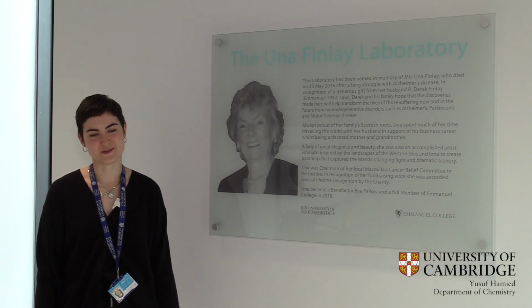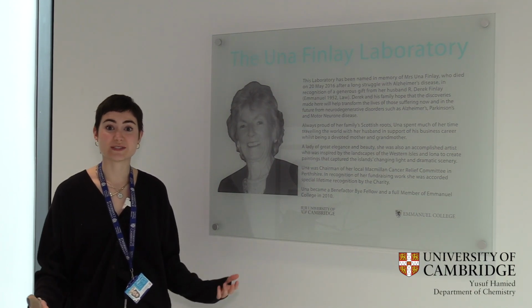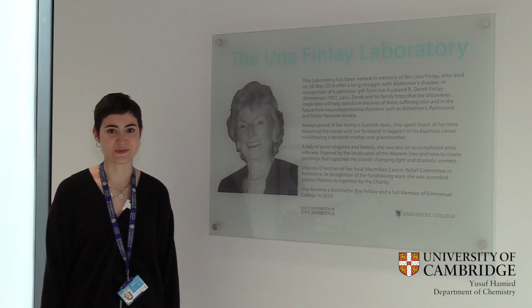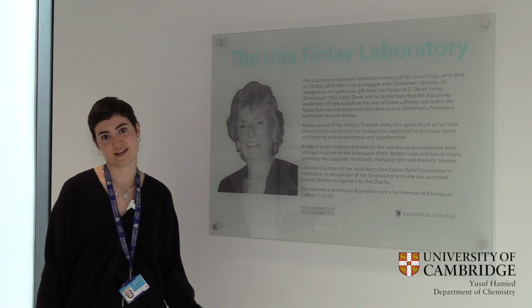Welcome to the Center for Misfolding Diseases, or the CMD. We're here in the Chemistry of Health building, which was specifically built for us a few years ago. So we have really excellent facilities which enable us to do really exciting world-class research.